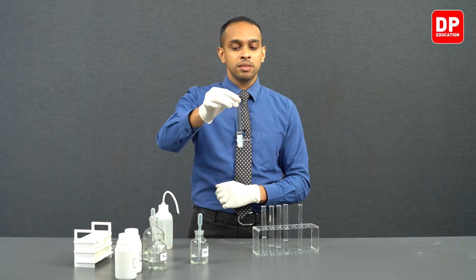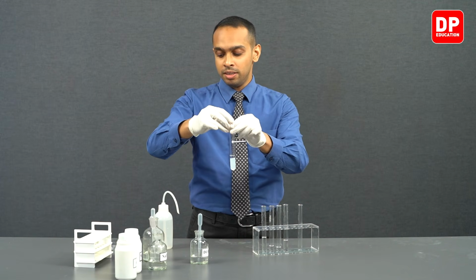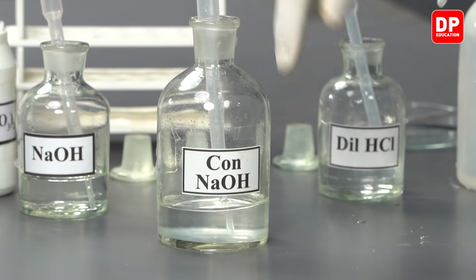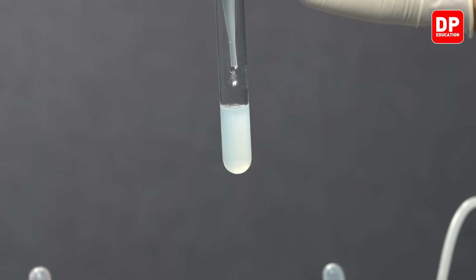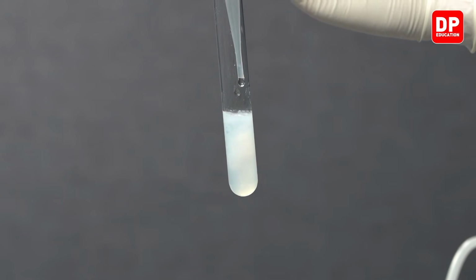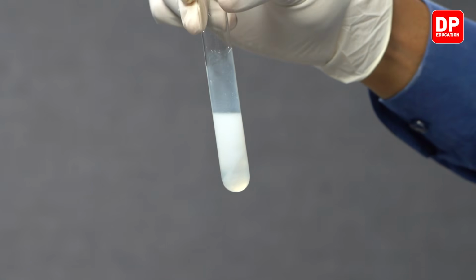And if you take the second magnesium hydroxide suspension sample we have here and add concentrated sodium hydroxide to it, we have our concentrated sodium hydroxide here. If you add concentrated sodium hydroxide to it, let's see what happens. Do we see that the magnesium hydroxide is dissolving in concentrated sodium hydroxide?